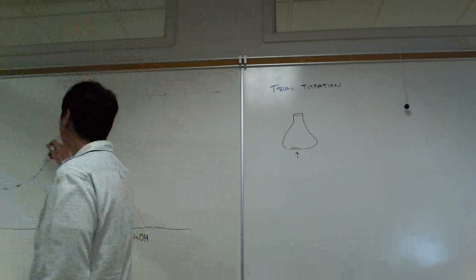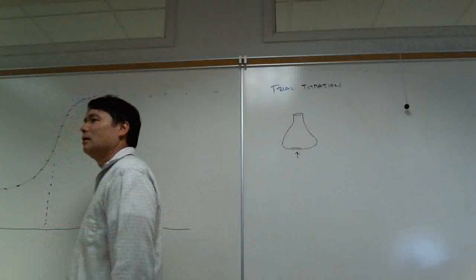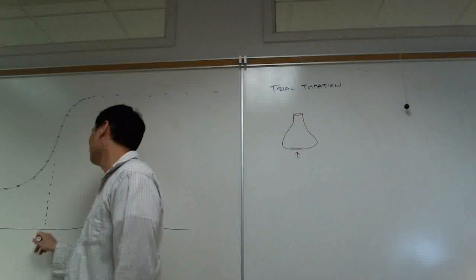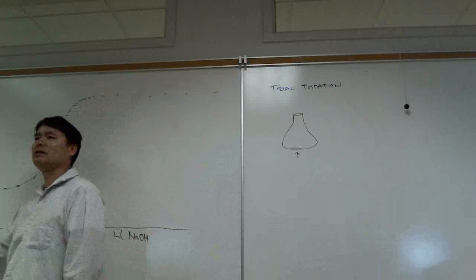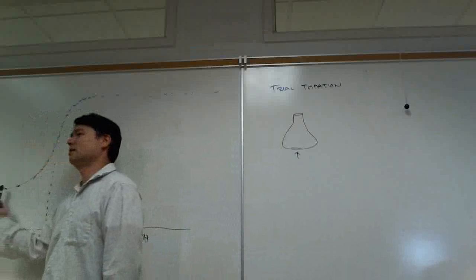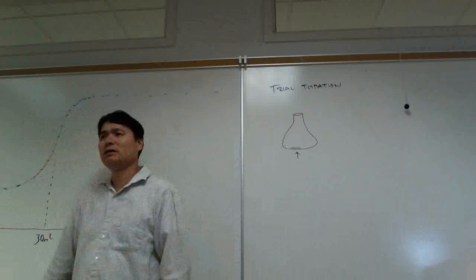When we hit the end point, we'd like this to be roughly 30 to 40 milliliters. And so let's just shoot for 30 milliliters here. So if your trial titration took only 10 milliliters to hit the end point, then you want to use 3 times that mass for your pH titration.